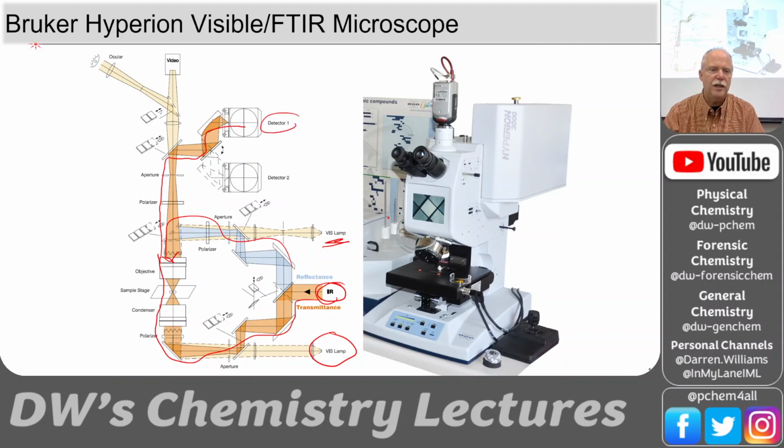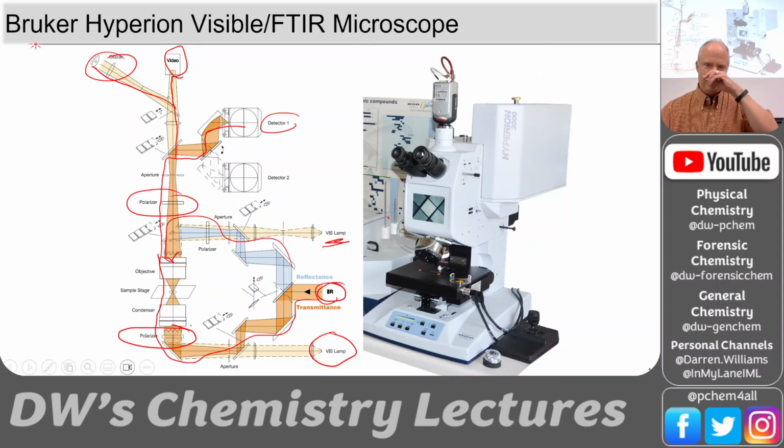You could have multiple detectors. It can go to the video. You can get an image, video or static, and then it goes to your eye. Okay. And then it also has polarizers. So we could do the cross polarizers on the top and the bottom. So it's a fantastic piece of equipment. The sad part is this mirror that switches from reflectance to transmission back here on the back, it's broke.